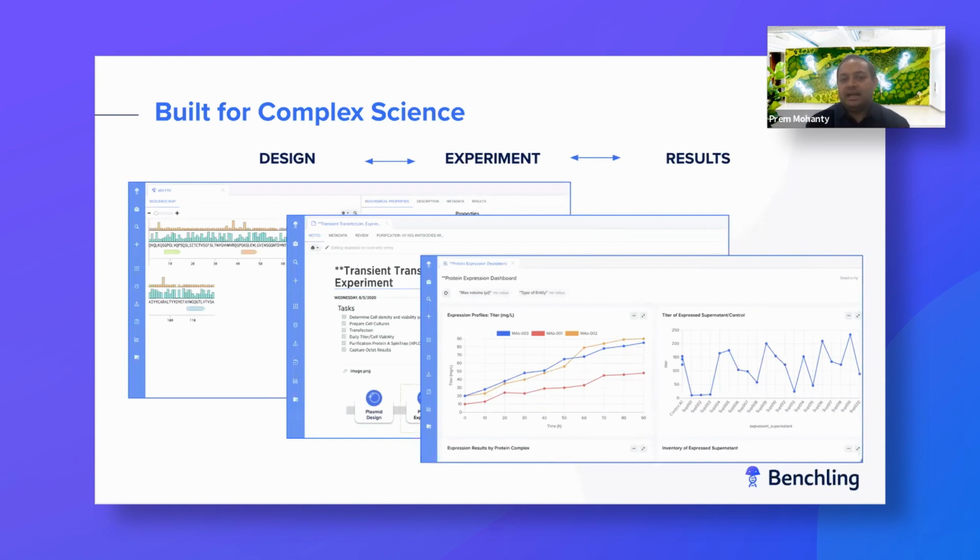This means at any point in the process, you should be able to trace your work back to all the preceding steps and underlying sequences. And more importantly, for scientific decision support, the data can be readily queried across any dimension of the data model. This is a necessity to start building in automation and machine learning routines.